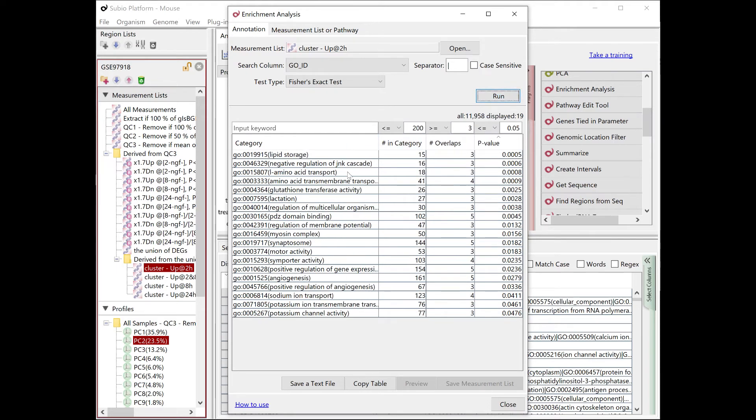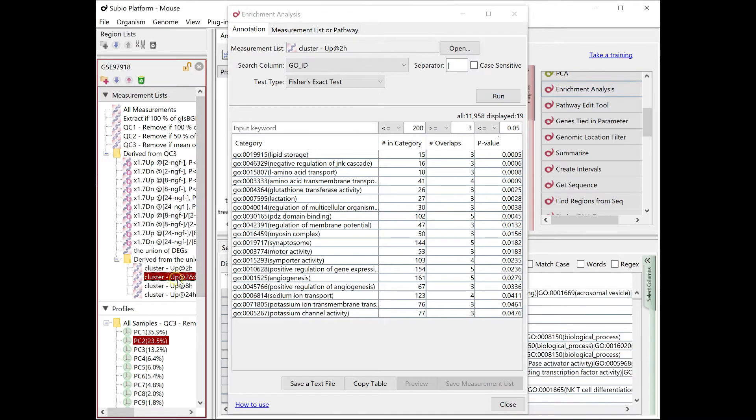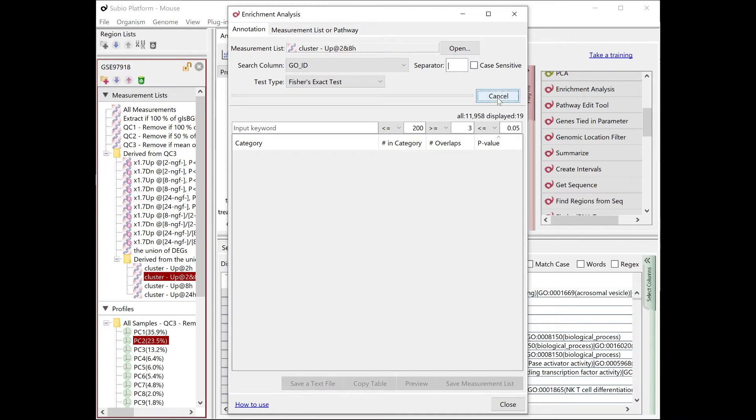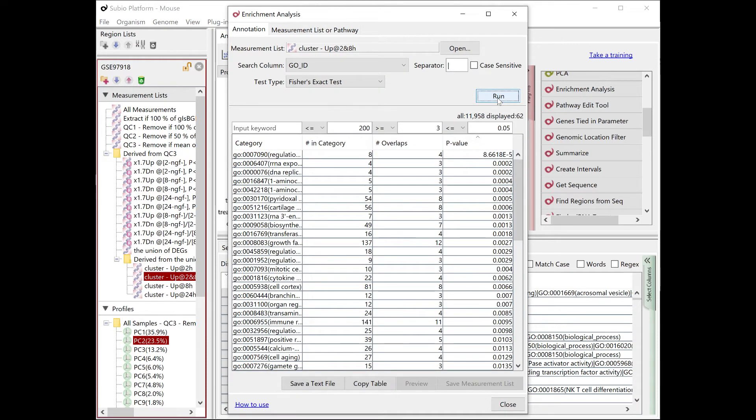See that enriched GO terms of genes, which NGF elevates expression levels for, differ from time point to time point.